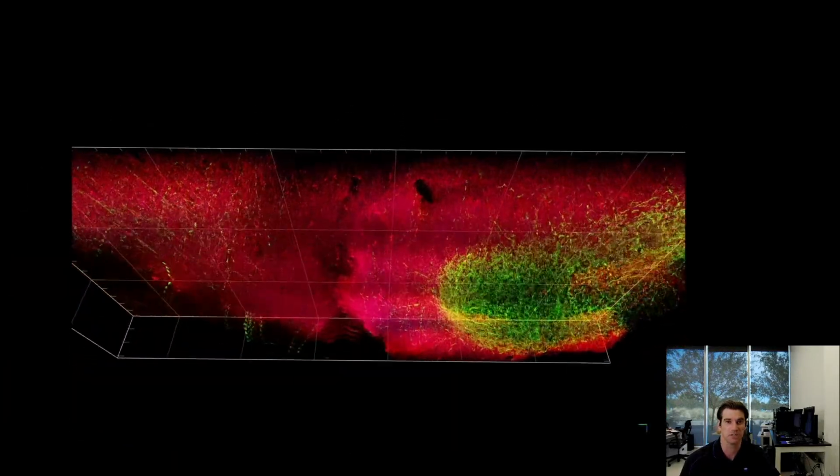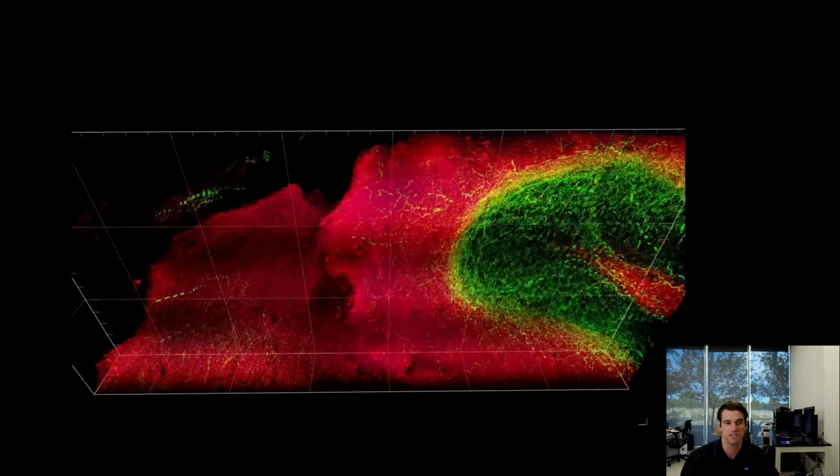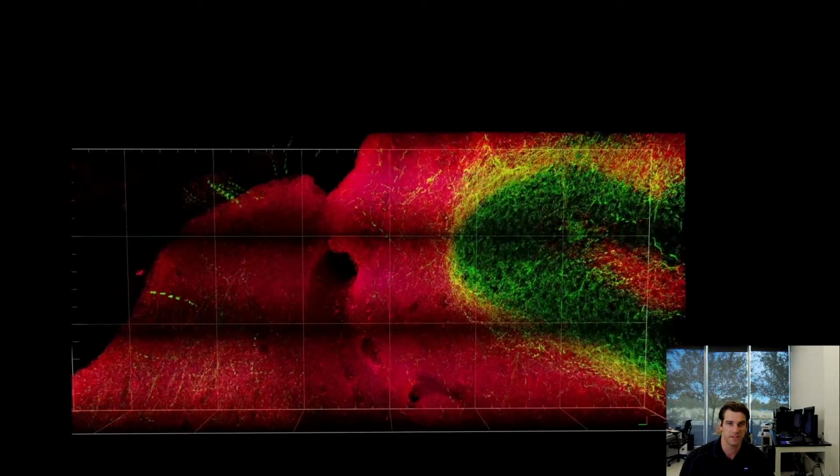You can actually see that we're looking at a brain. And this image that we took, this volume, was a volume that was over 700,000 times larger than the best Z-stack that they were able to get on a confocal or an inverted system of any kind. Right? And so that's really what we're talking about when we're moving to the system. It is not a small change.